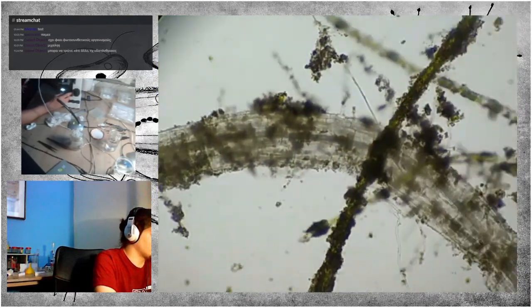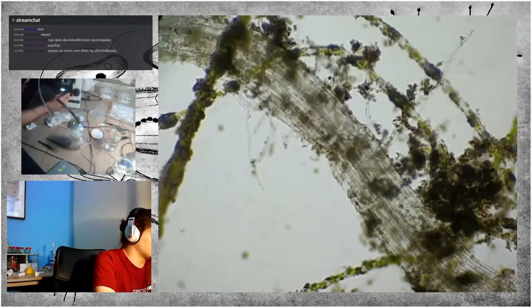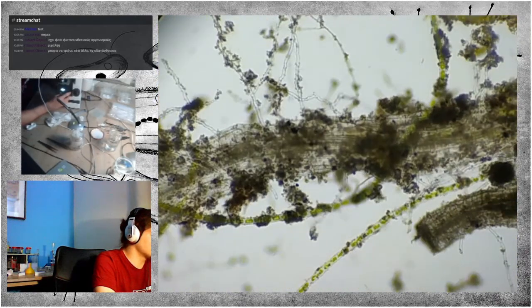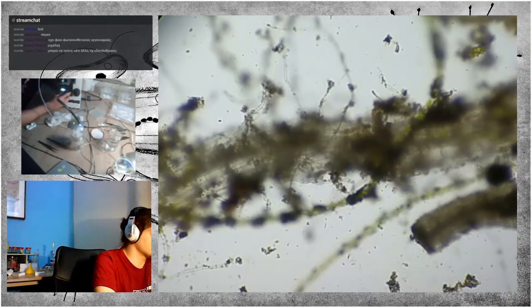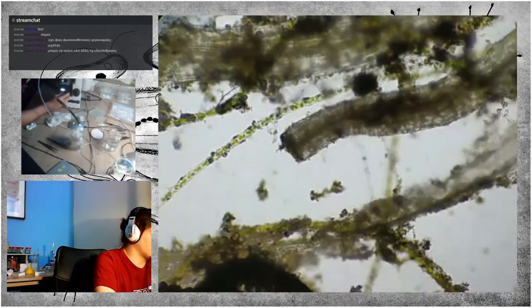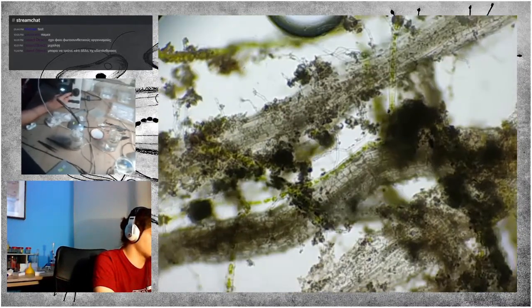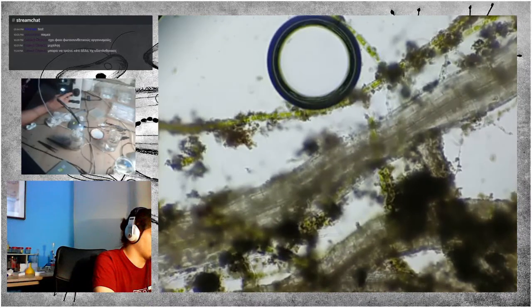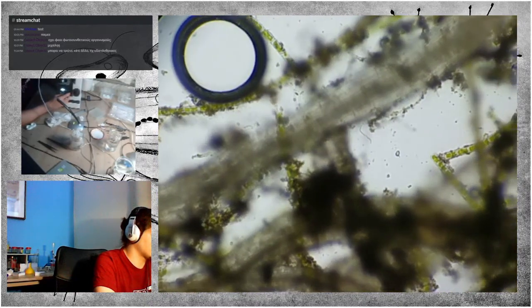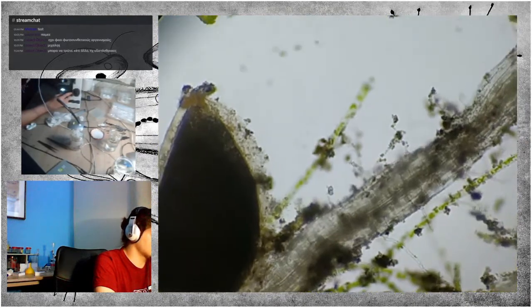Or microanimals like copepods or daphnias, or larger worms, annelids, or insect larvae. Those can be quite common in some places too. But yeah, this slide is quite disappointing. It is not as rich as the previous ones.